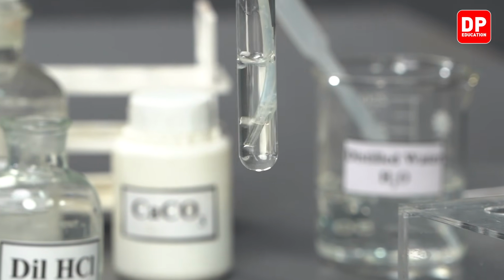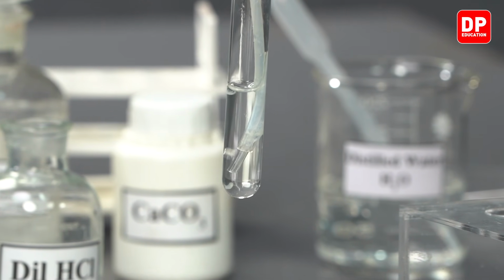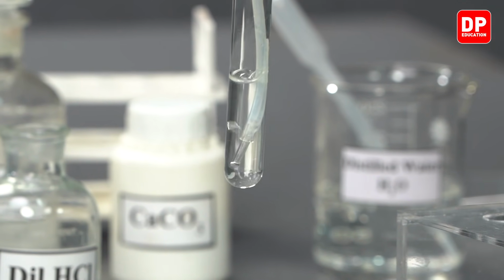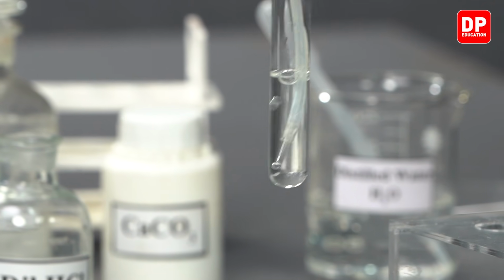Did you observe that milky solution completely turned clear when carbon dioxide was sent through it?